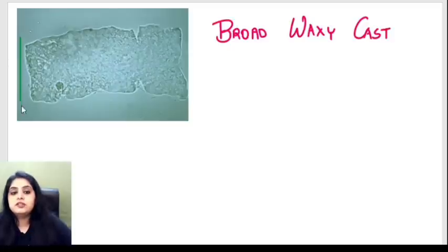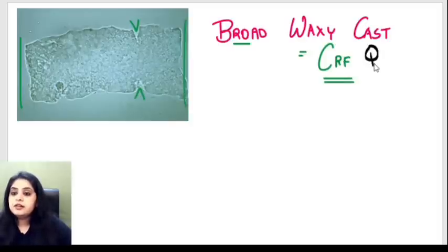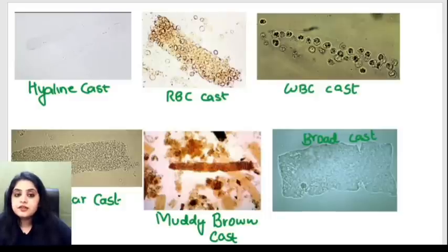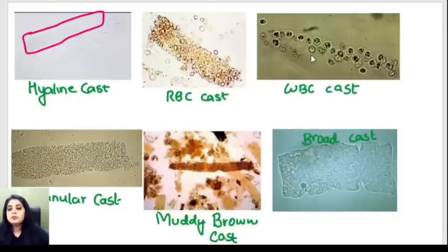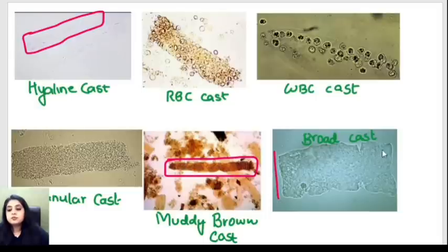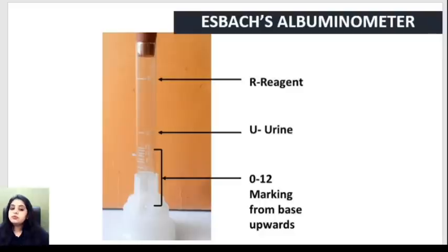The last cast is the broad waxy cast. Compared to the others, it is broader and kind of broken. This is the cast of chronic renal failure — a very important exam question. To summarize all casts: transparent is hyaline (normal); RBCs on top is RBC cast; WBCs on top is WBC cast; degenerated is granular cast; dirty and muddy is muddy brown cast; broad and broken is broad waxy cast.